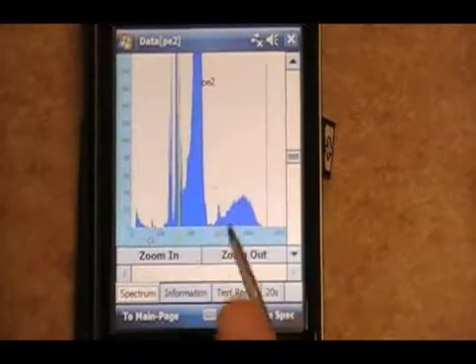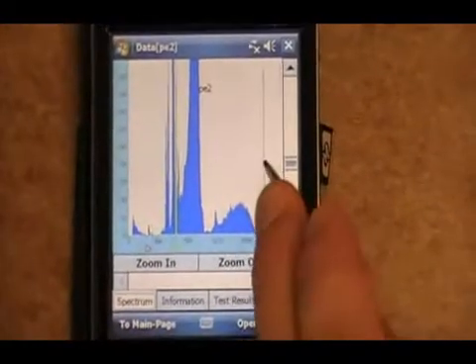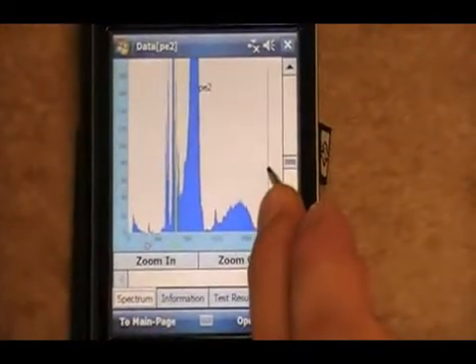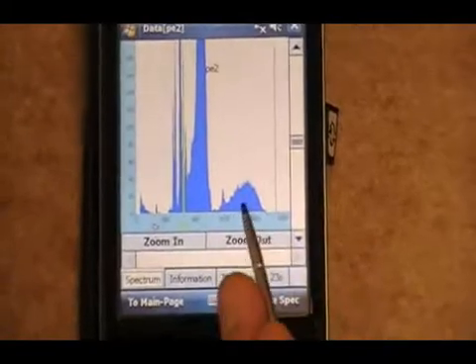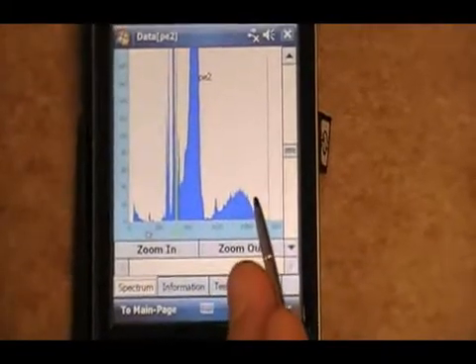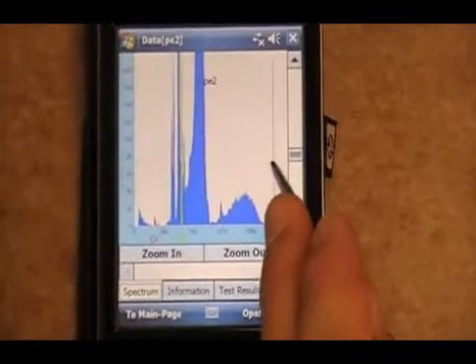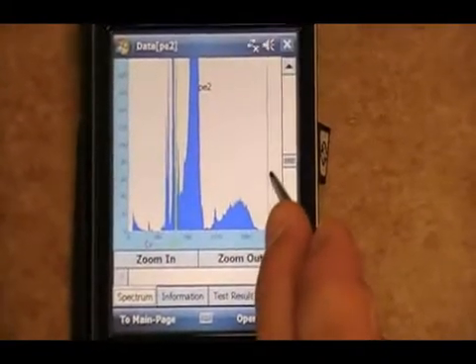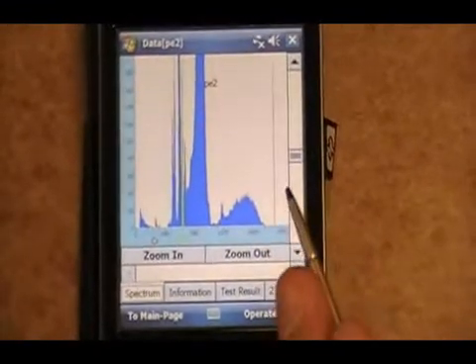So there you can see the other elements fairly well. And we'll add a couple. I always think it's good to see where the cadmium is.